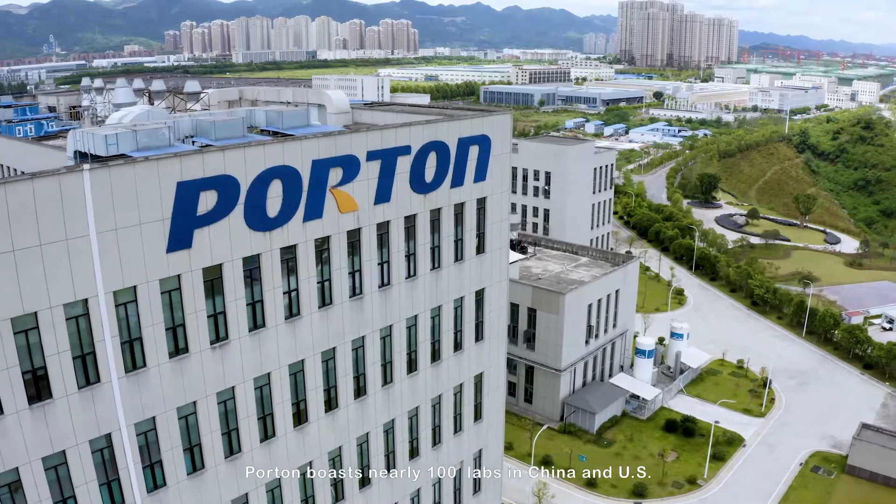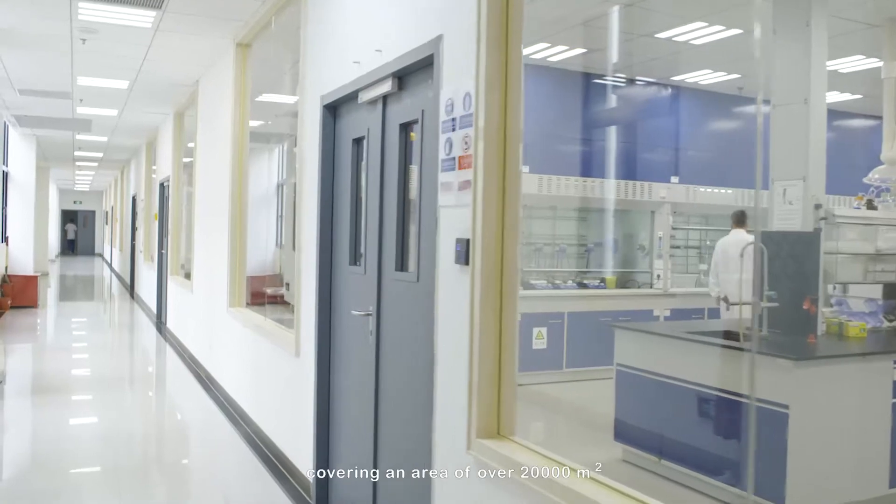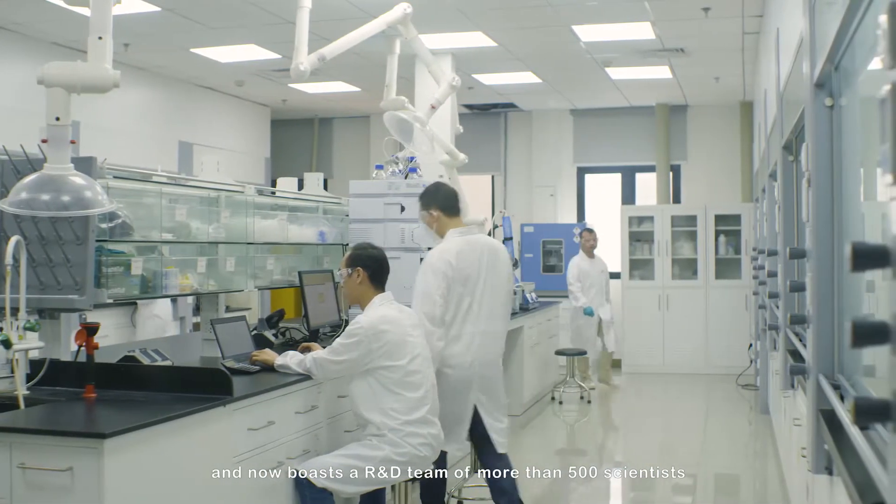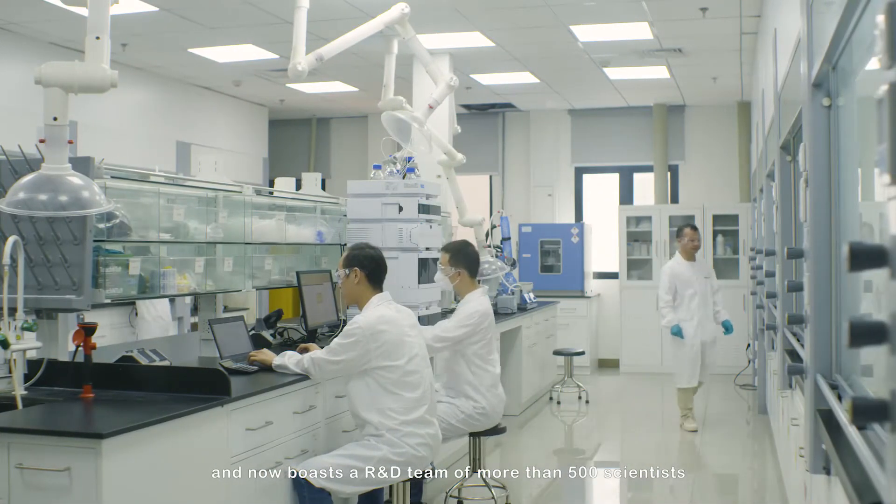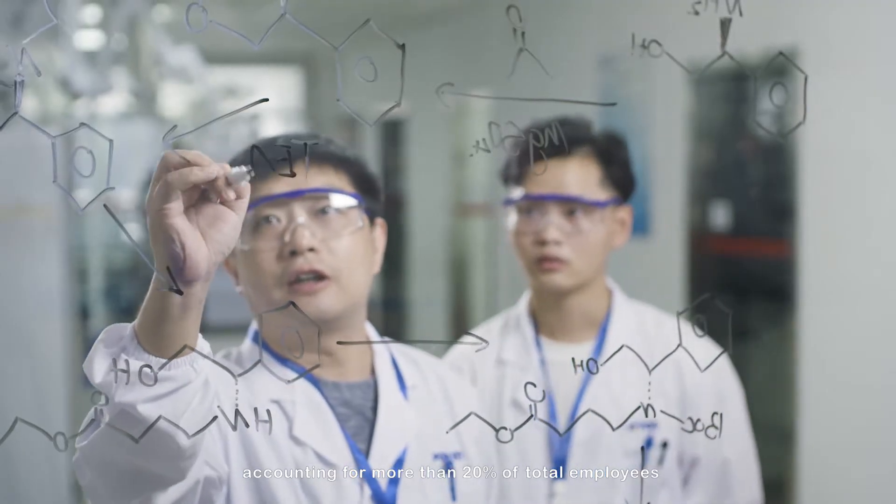Porton boasts nearly 100 labs in China and US, covering an area of over 20,000 square meters. We have constantly brought in pharmaceutical talents and now boast an R&D team of more than 500 scientists, accounting for more than 20% of total employees.